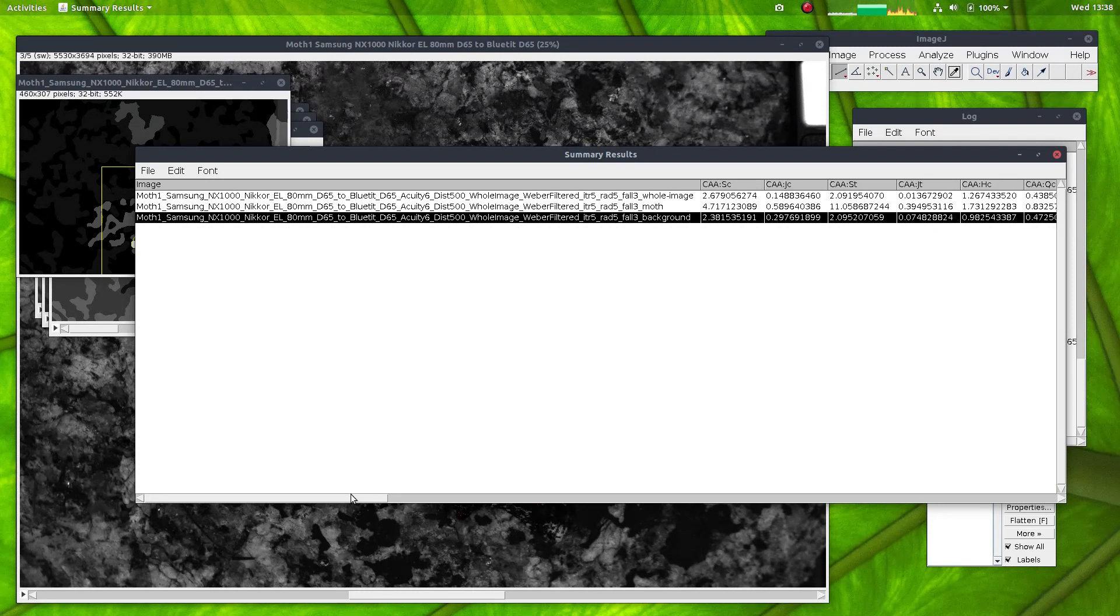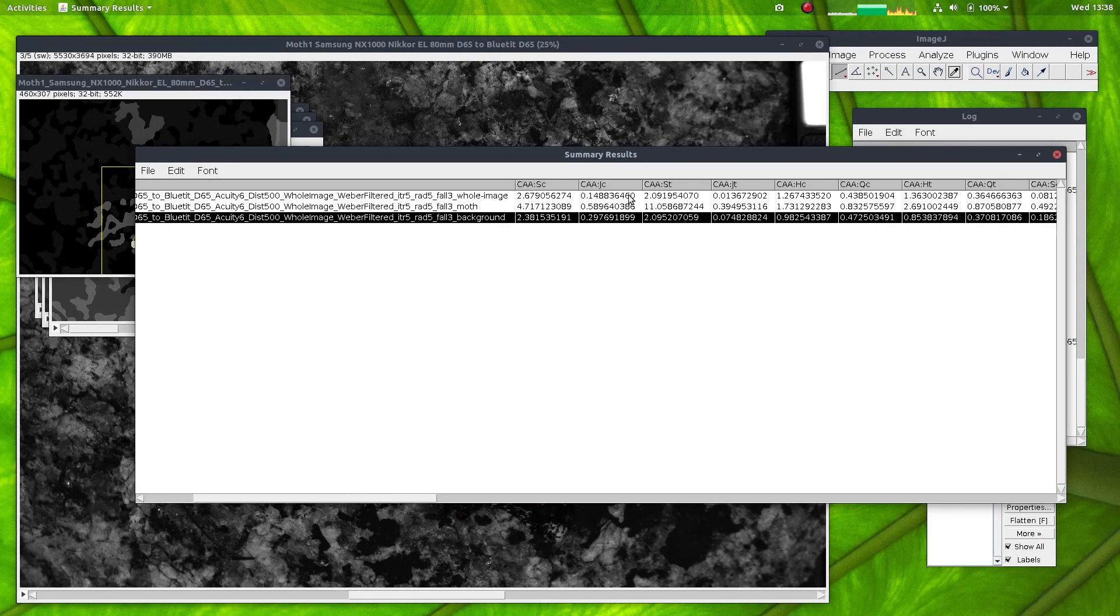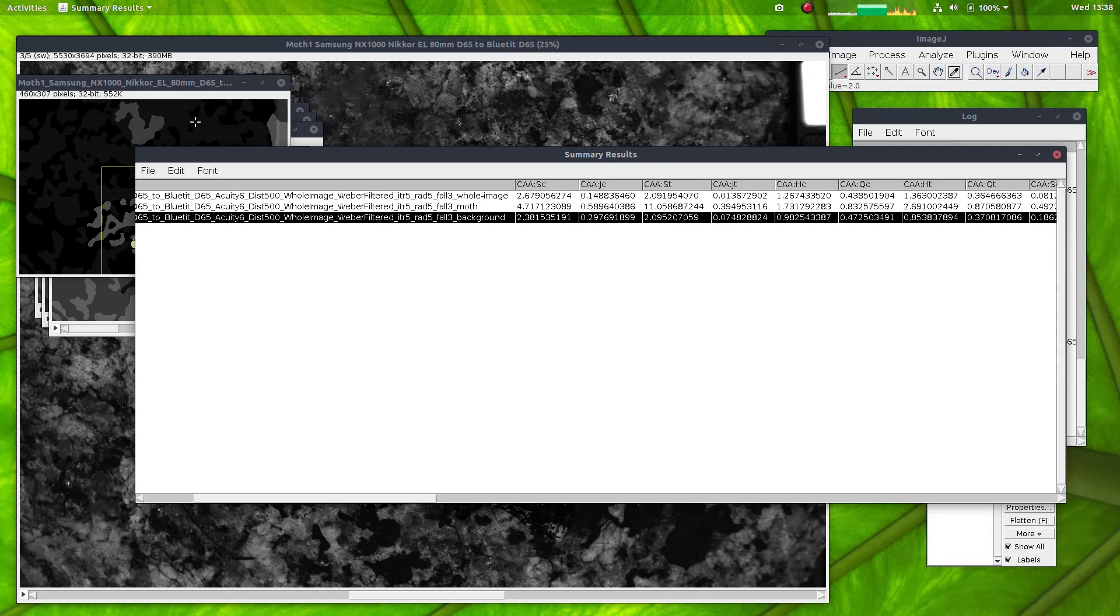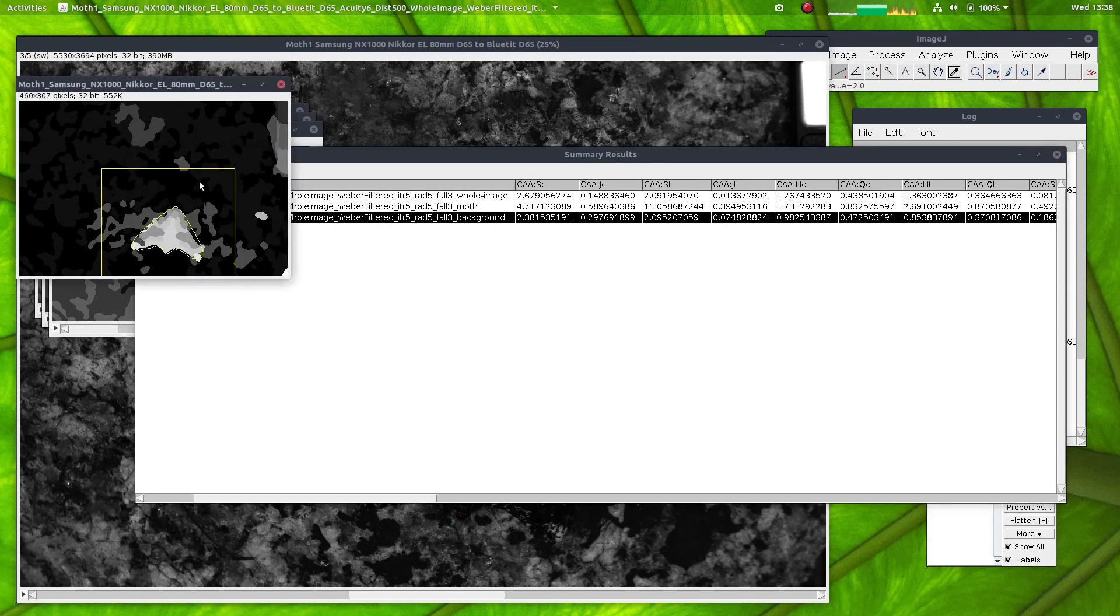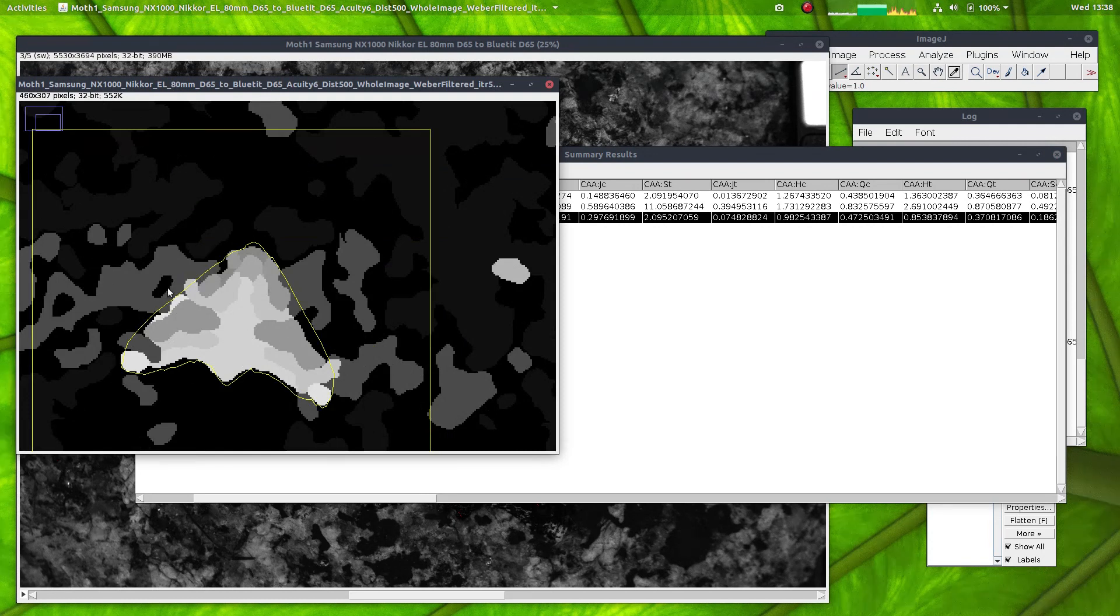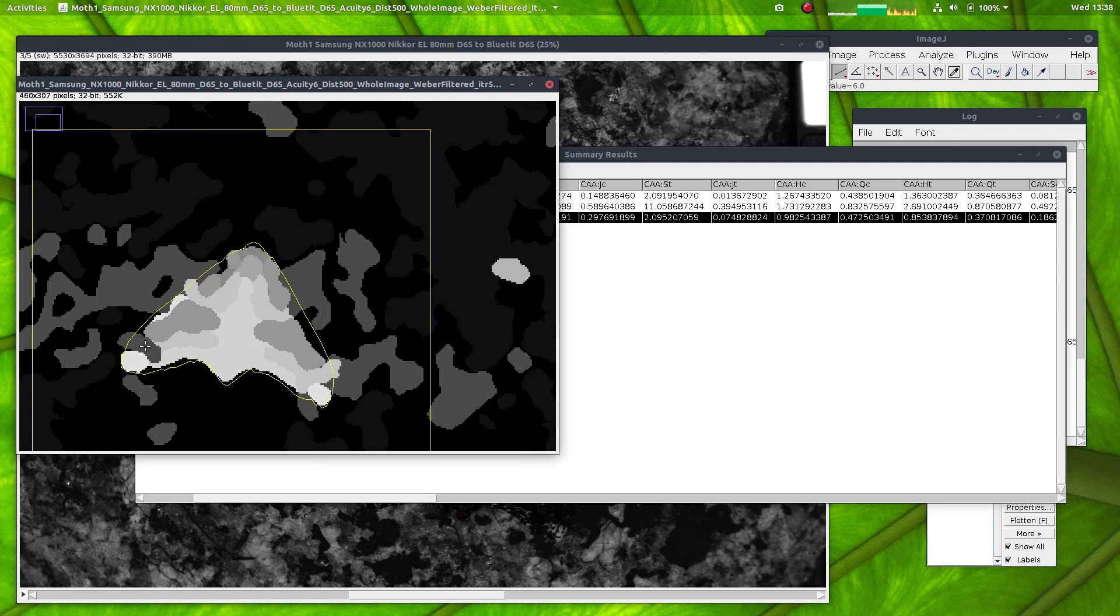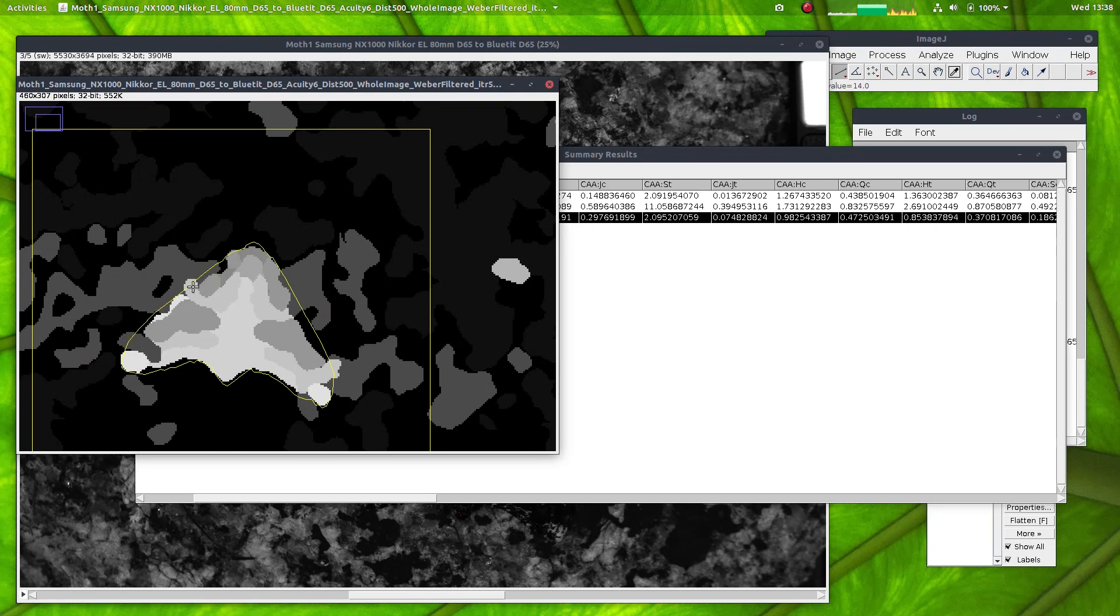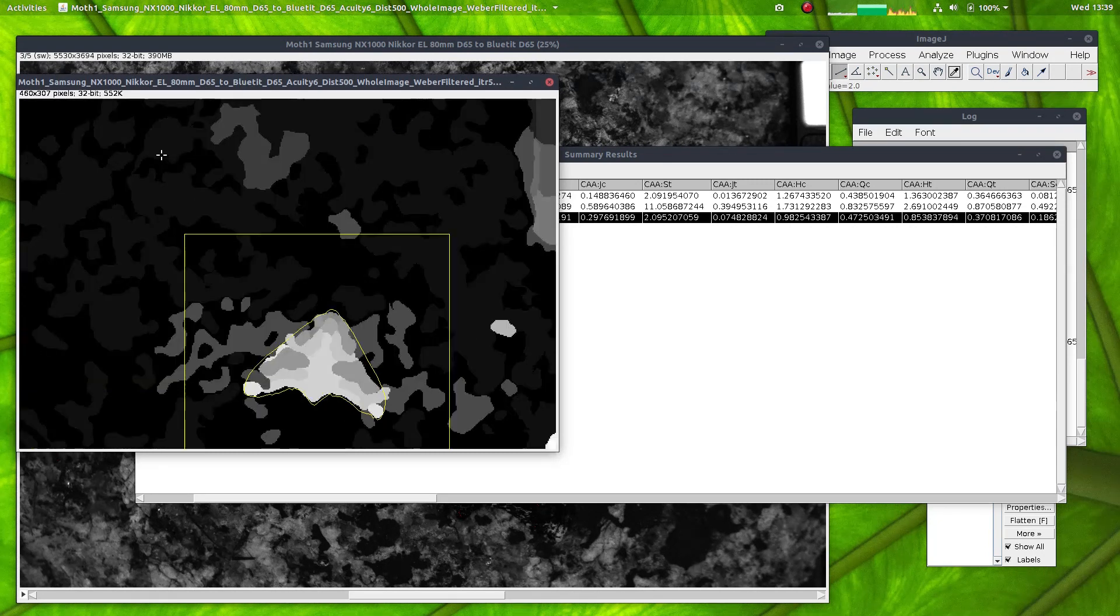And each of these have been measured on their own, but it's important to note that these have all been clustered together. So for example, if we look at the outline of the moth here, when it's been clustered with its background, there's been lots of overlap between the background and the moth. For example, we have a bit of apparent continuity here between a region of background and the color in the moth.